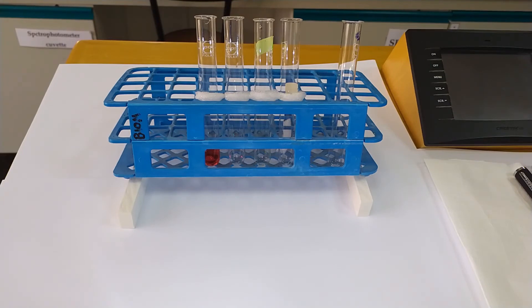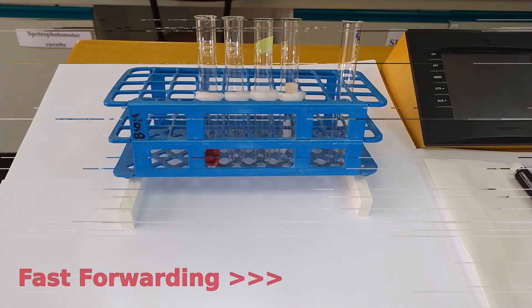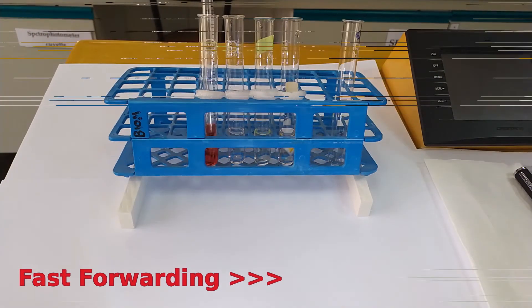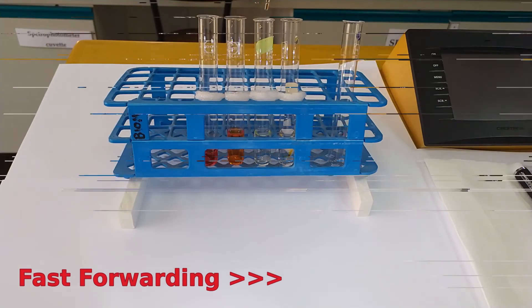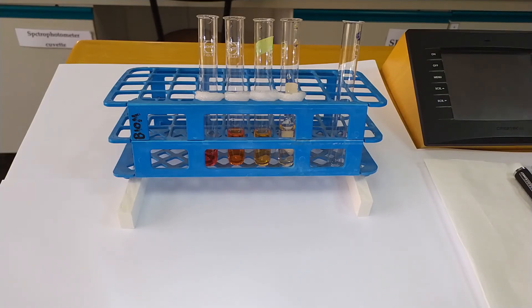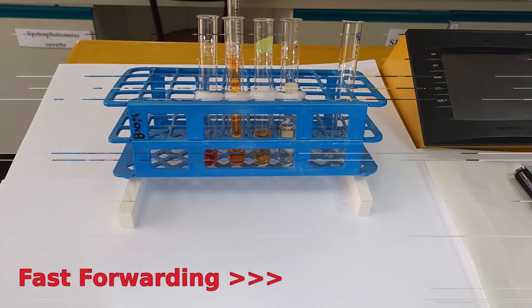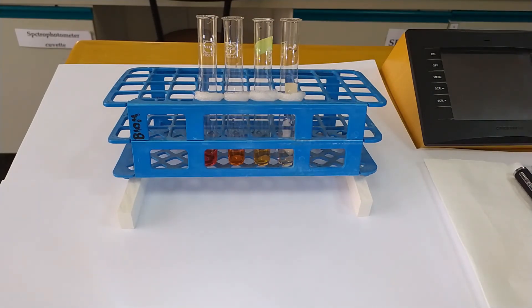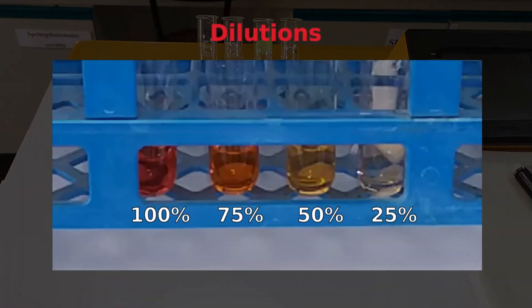Now, here we have a red solution. Let me prepare a few different dilutions to produce a range of concentrations of this color. I'm just going to equalize the volumes. Get rid of the waste tube. Okay. And so now what you can see is that we have a range of colors based on the original red color.